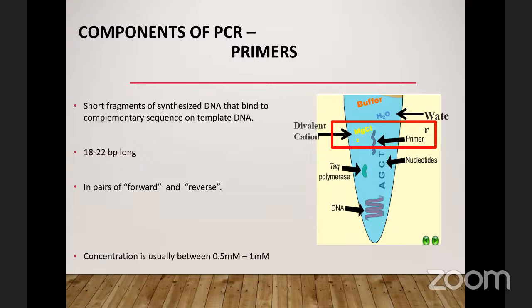Primers will be very specific. They are designed to be specific, and they are designed to anneal to that target alone that they were made for. Primers cannot cross-anneal with any other target they were not designed for. So in essence, if I design primers for organism A, they cannot target and amplify another organism, if I have followed all the rules of primer design correctly.